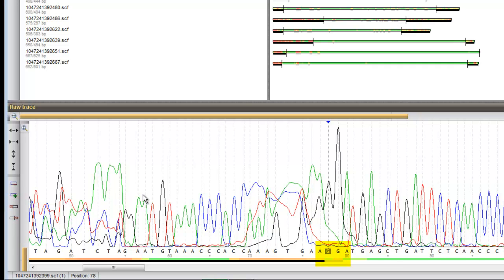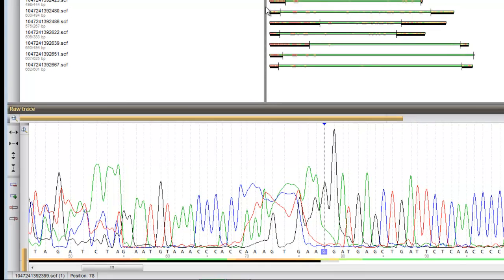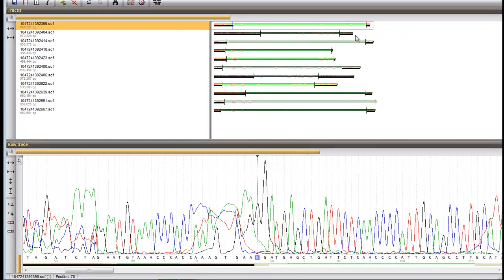The black bar is removed from under the black peaks, meaning that they will no longer be trimmed off. The same goes for adjusting the end of a sequence.